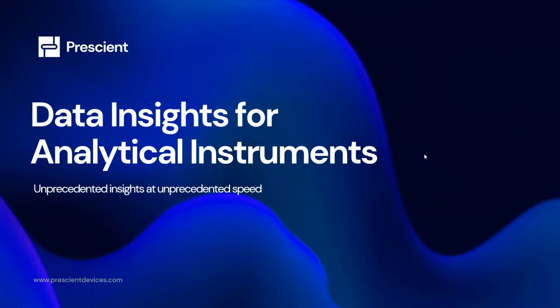This video shows the type of data insights you can derive from analytical instruments. Analytical instruments are used for test measurements of properties of physical material. They're used in industries such as medical, chemical, oil and gas, food processing, etc. These are pretty complex machines, and they generate a lot of data, both measurement data and status data. A lot of insights can be derived from this data, especially when you analyze the data from many instruments.